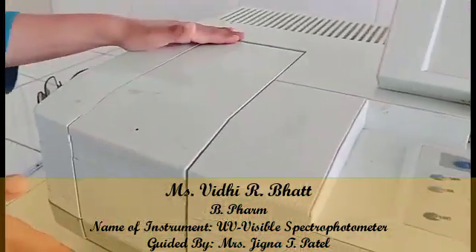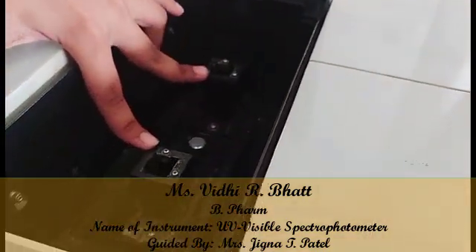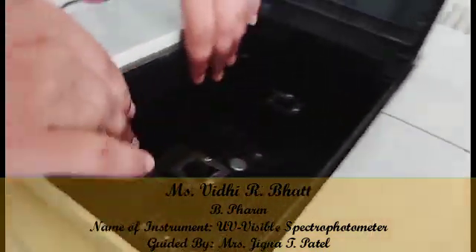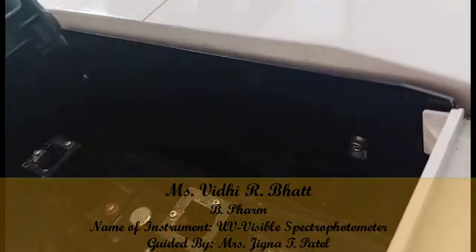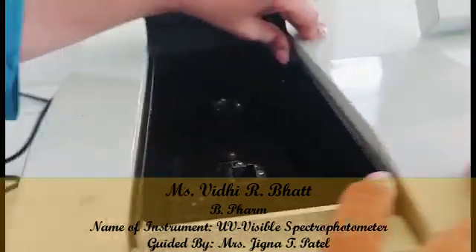There are two chambers because it is a double beam UV spectrophotometer. Here is the light source used for absorbance, and here is the detector which detects the absorbance.